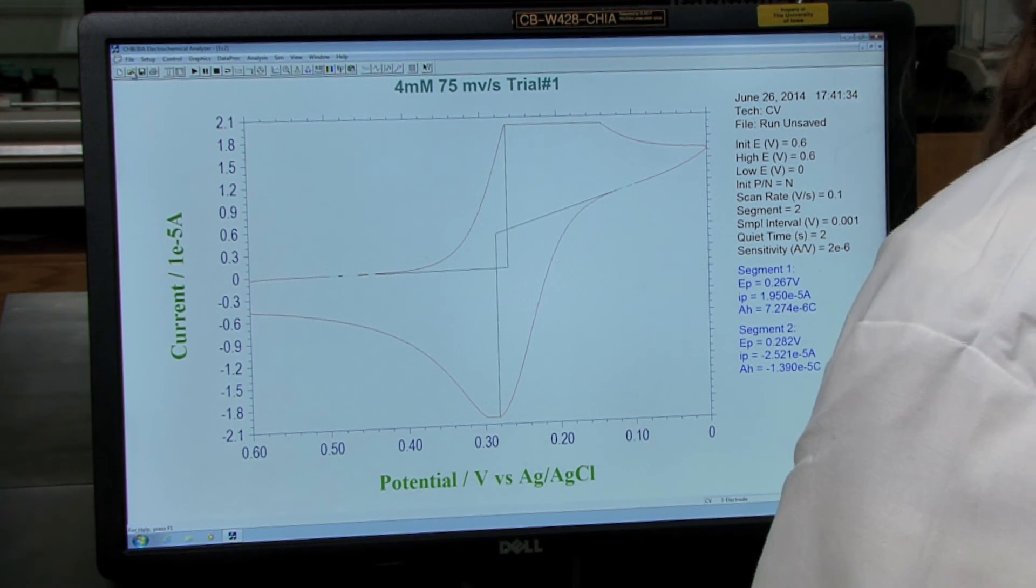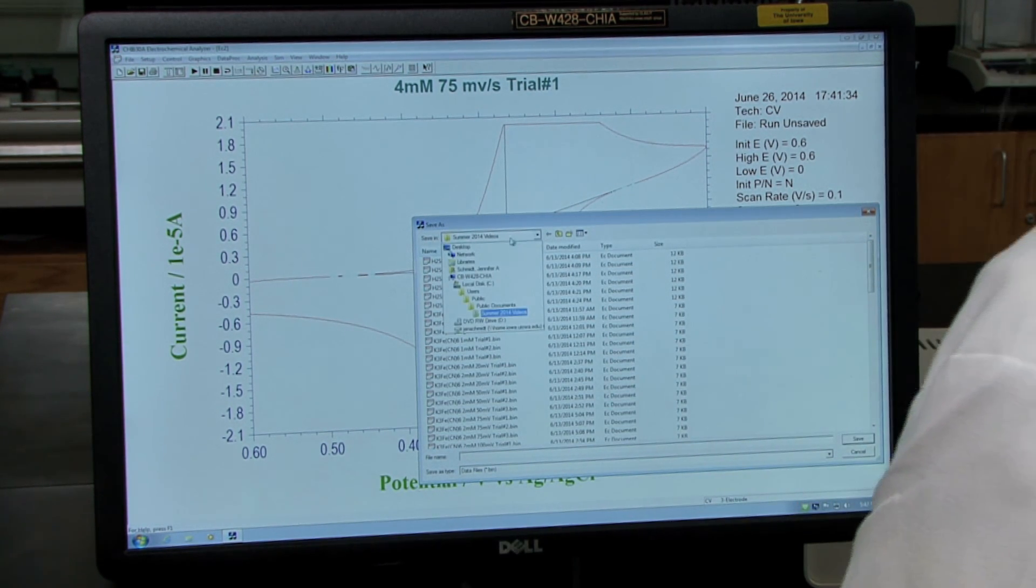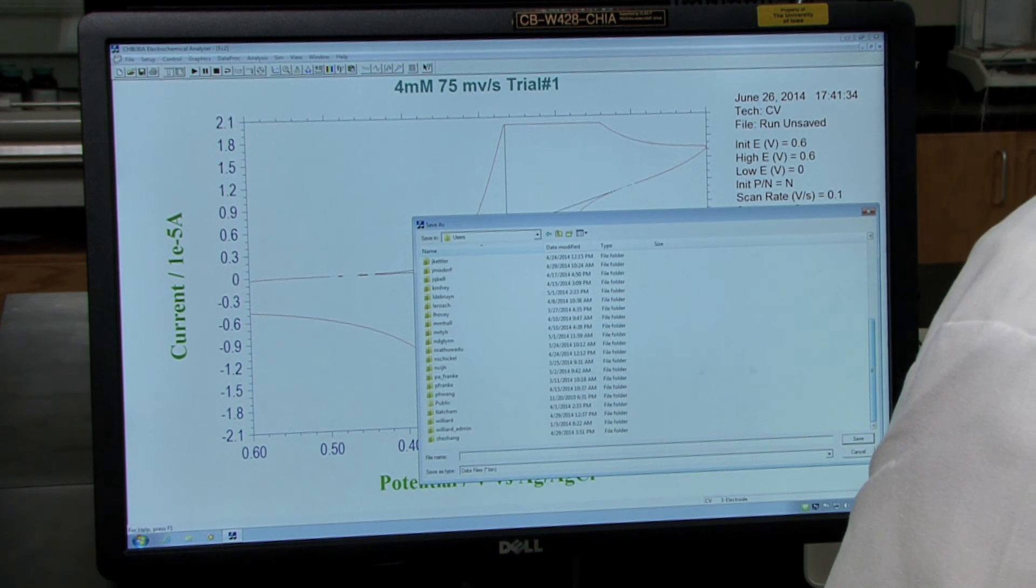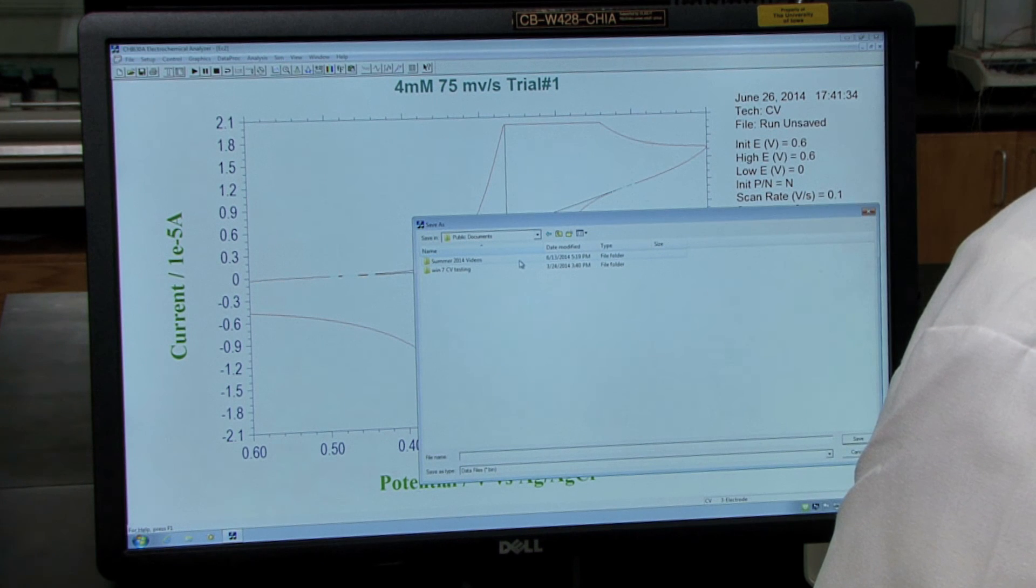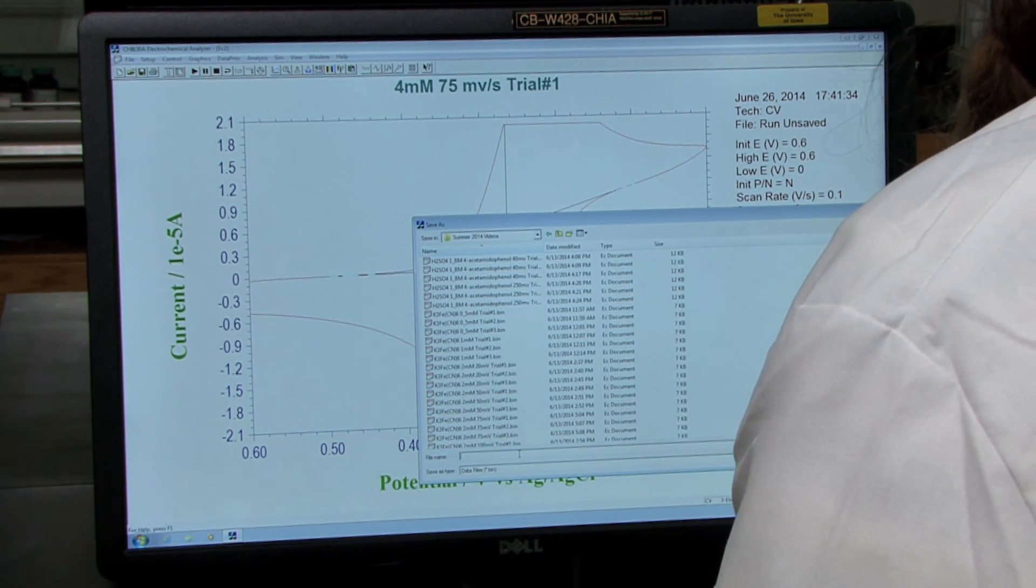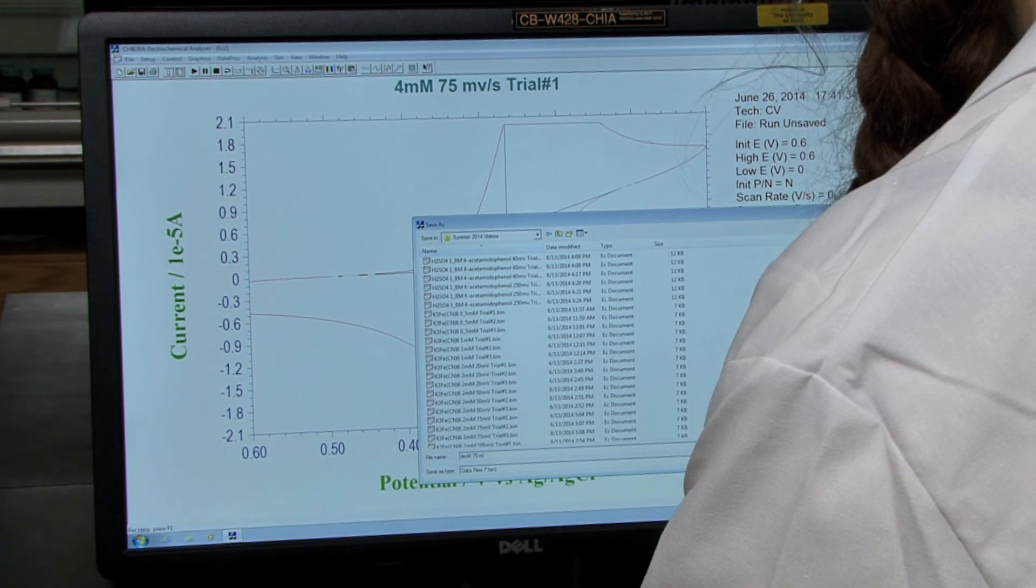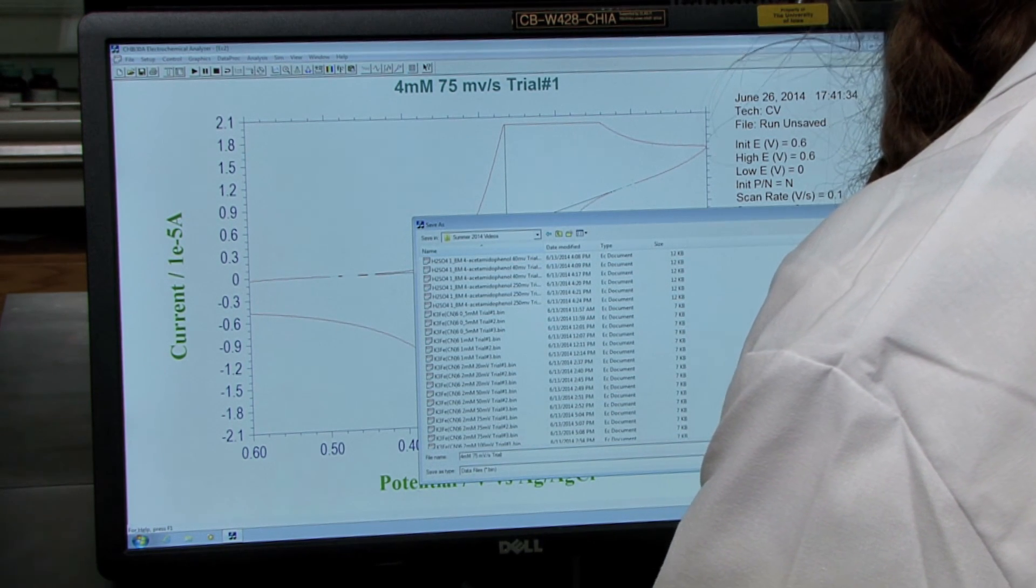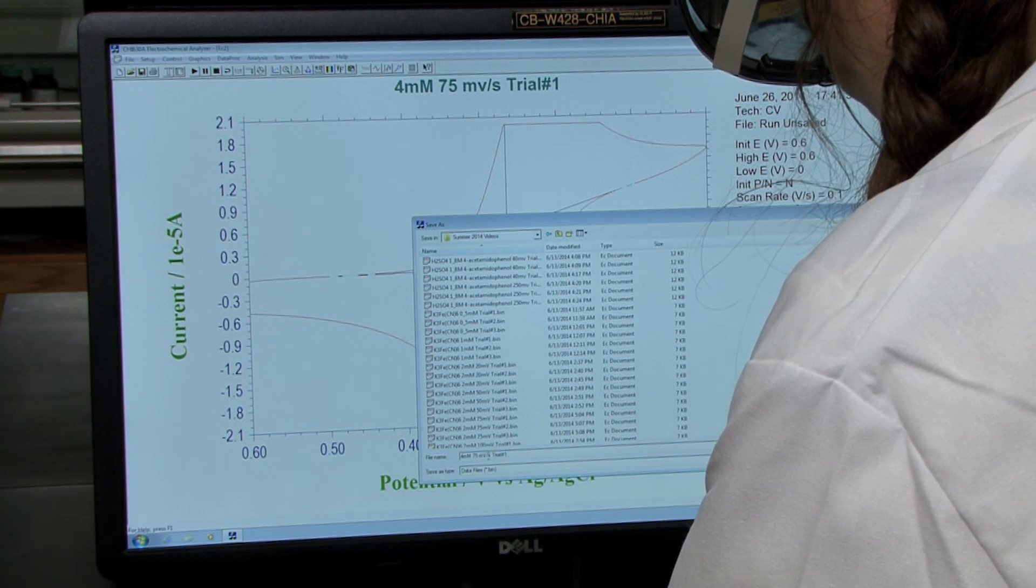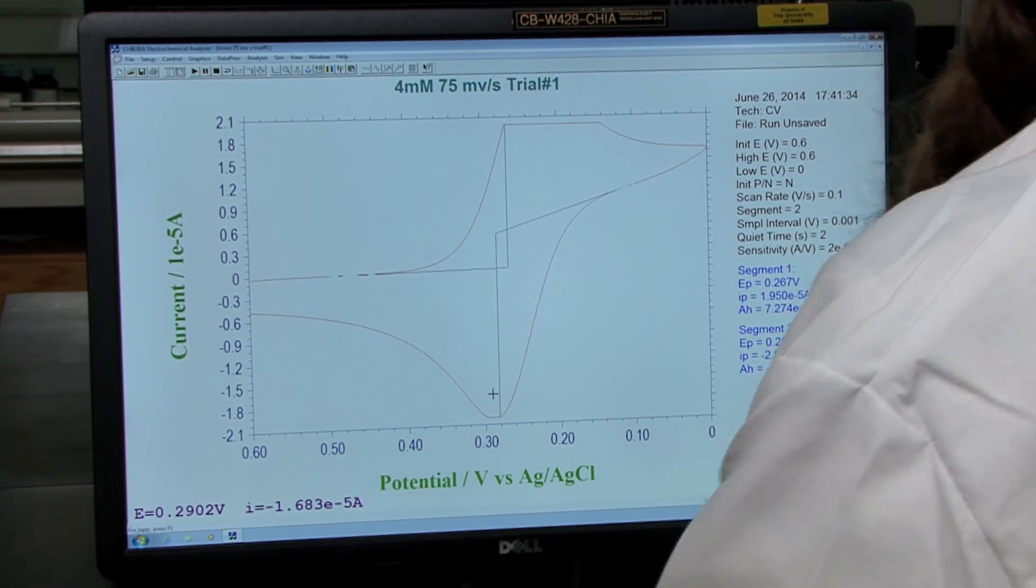To save the CV, go to file, save as. You want to save it in a public space so every member of your group has access to it. I'm going to save this under local disk, users, public users, public, and then in public documents. I've created a folder here. Again, the same thing applies when you're saving your file name: do not have any periods or decimal places, otherwise it will not save properly. Then you can just hit save. Now you're ready to move on to take the second trial of your solution.